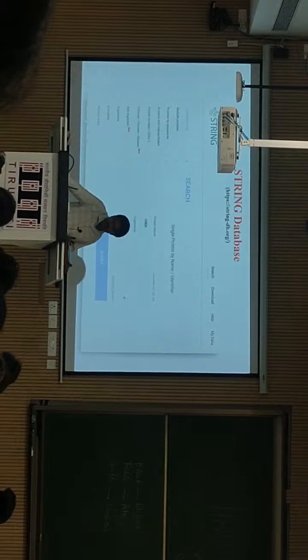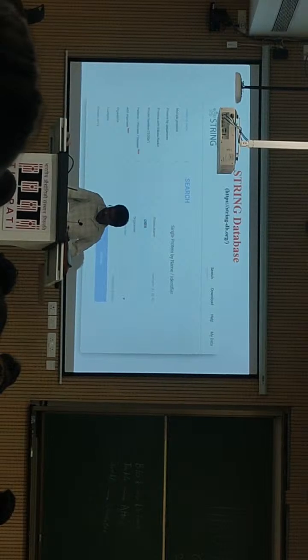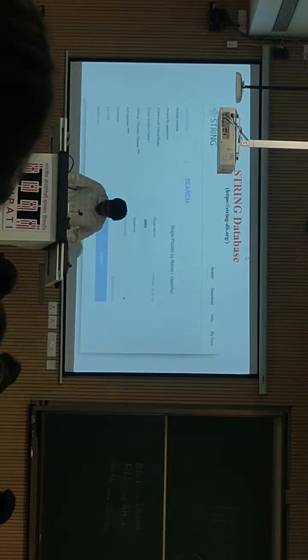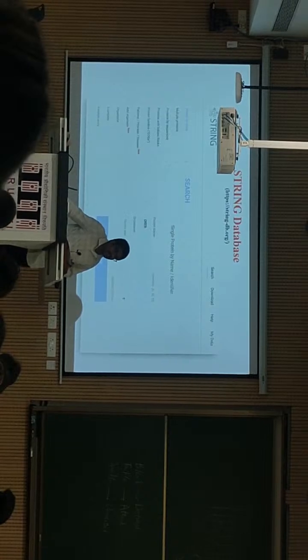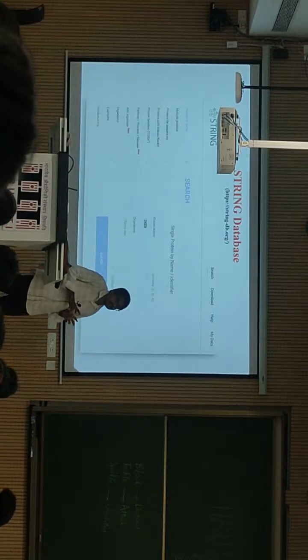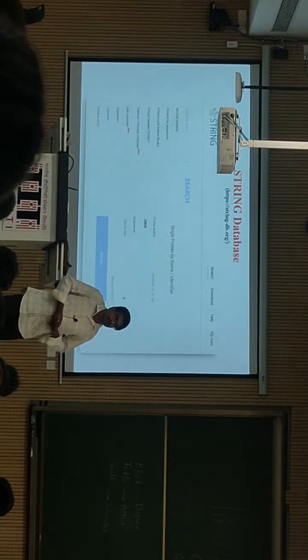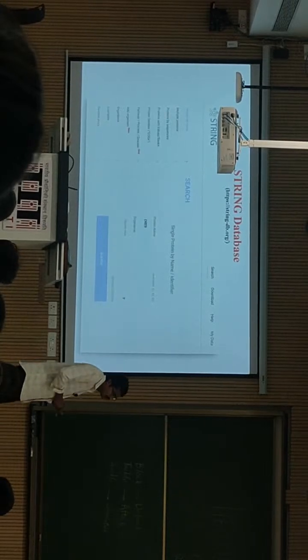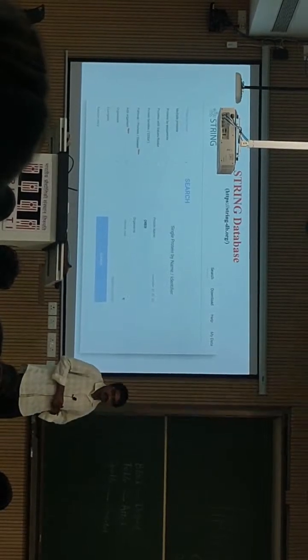Okay, this is the STRING database. Here we have some tricks. We have already edited some lines. Correct. We got the chromatogram. We got the ABI form along with the PDF form. The ABI form is an editable version. We go for the BioEdit tool and then we can retrieve the respective sequence from the software itself.